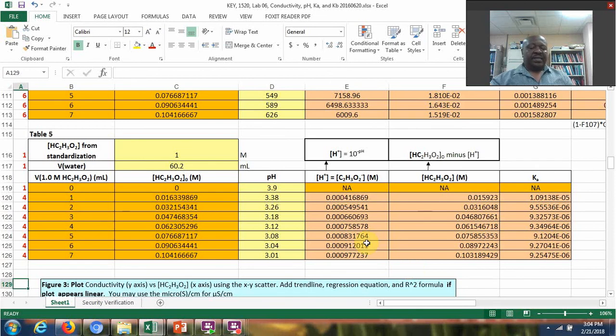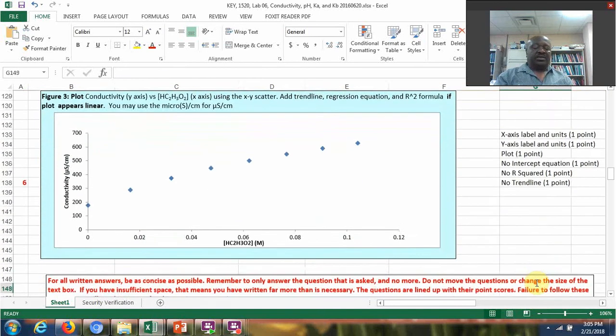Here's a calculation based on pH. Same concentrations as before there. Here's the data, the pH, and then you calculate these according to the equations above here, or you can look them up in the manual, or better yet, be able to reason them out yourself. And then look at whatever these values turn out to be, about 10 to the minus 5 here, if you round off the 9 something to 10, and so Ka seems to be a constant as well, at least based on my data. And then I'll ask you to do a few questions.